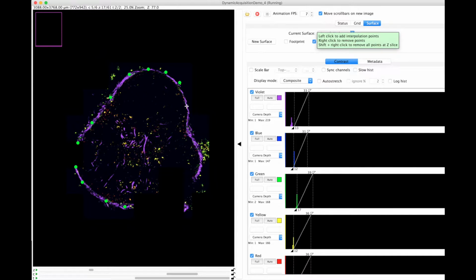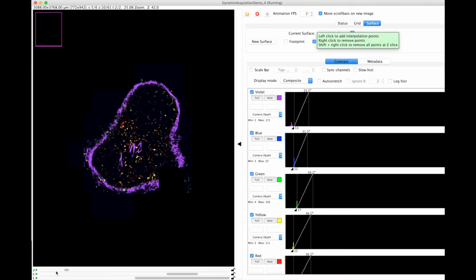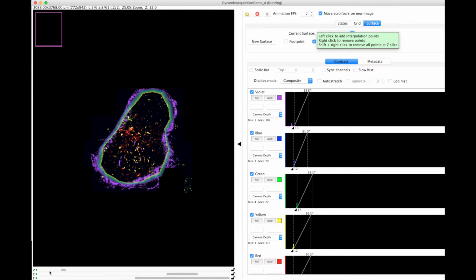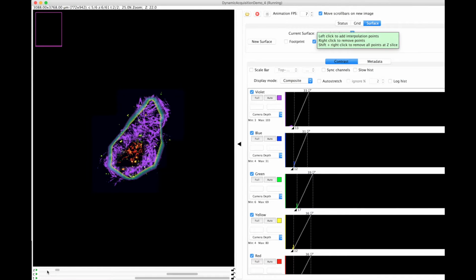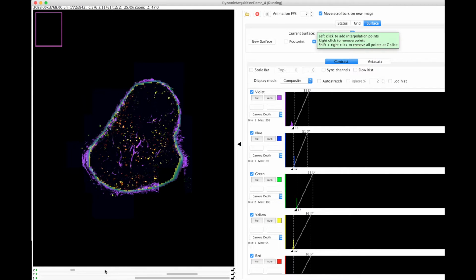Our updated surface will now accurately reflect the new shape of the lymph node. This will update the shape of our surface-defined acquisition volume at the next time point. In addition, it will update the gradient of excitation laser power determined by our covariate pairing.